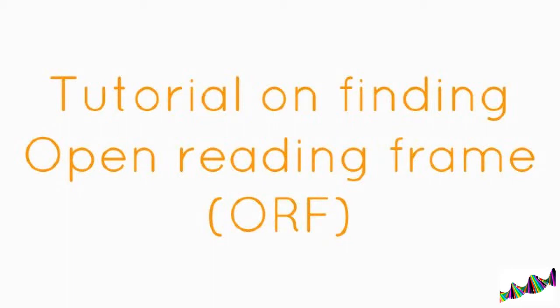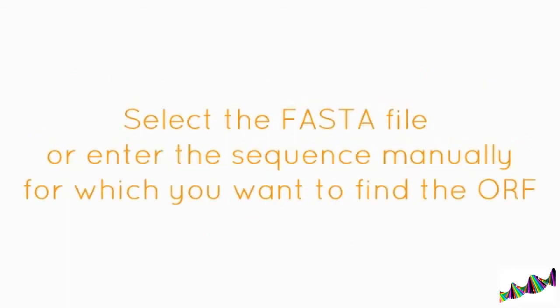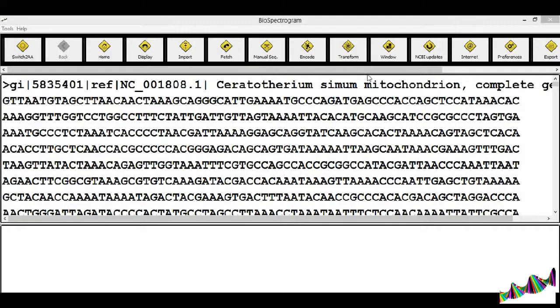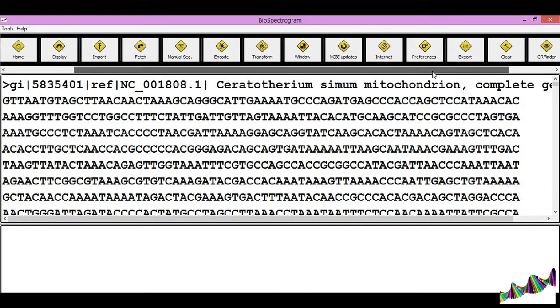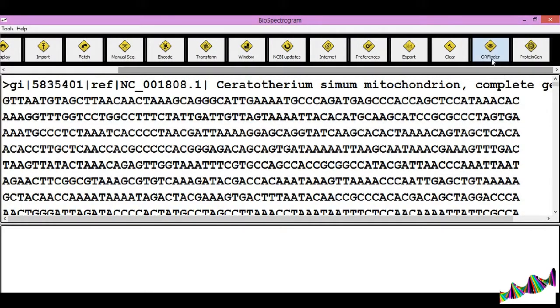This tutorial is on the ORF functionality of BioSpectrogram. Click on the ORF Finder icon.